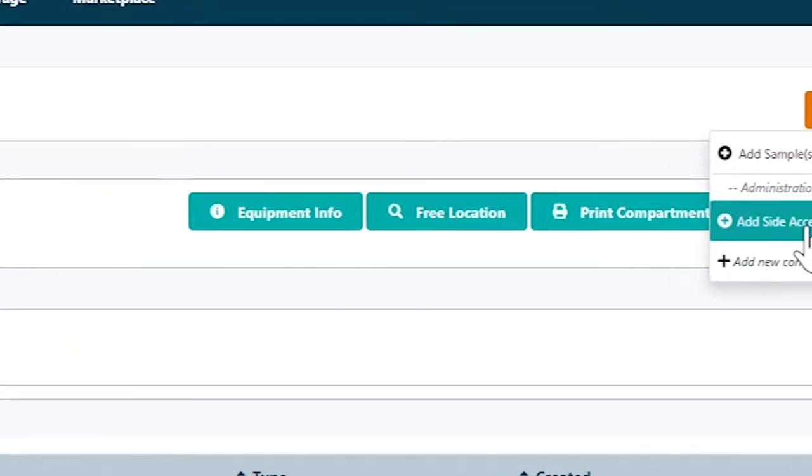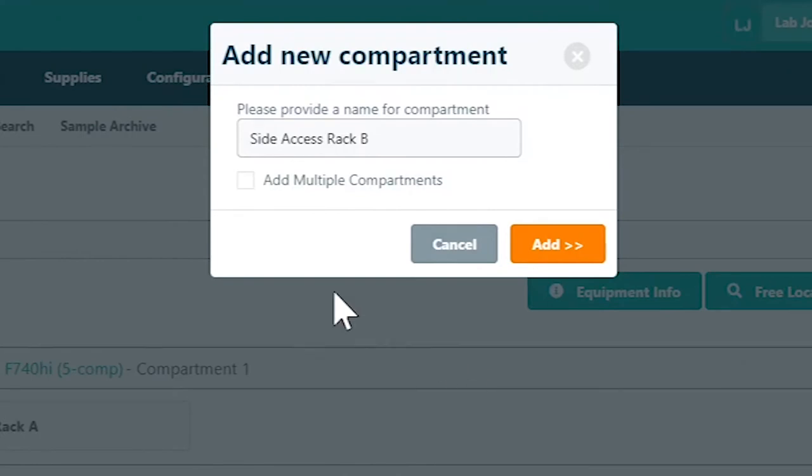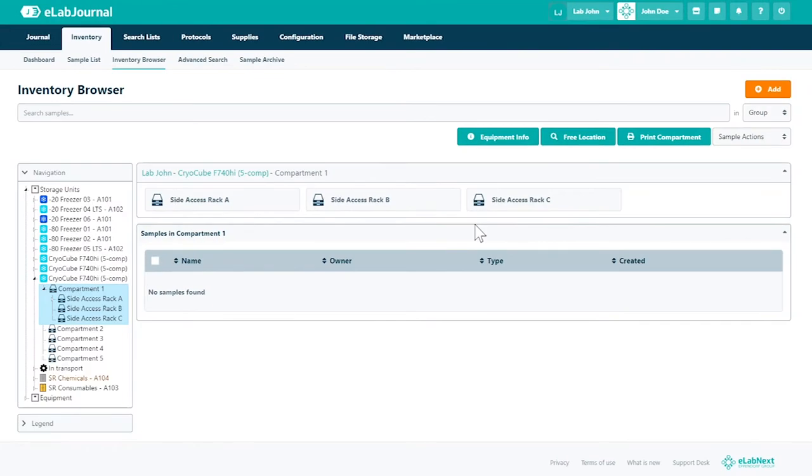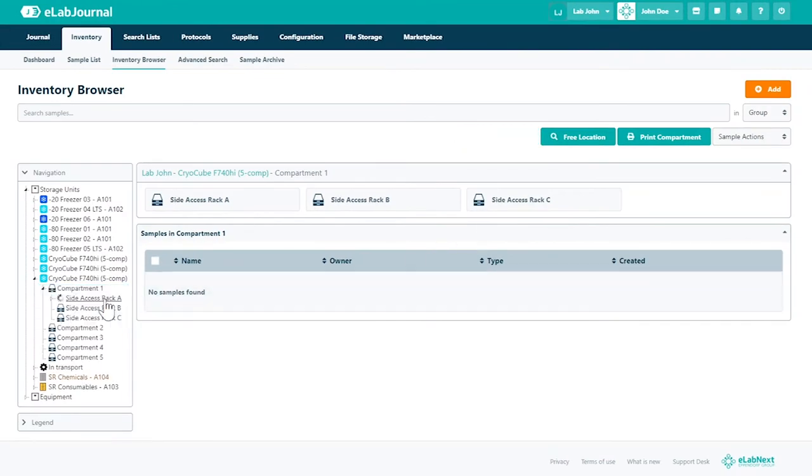You may wish to add more compartments at the same level. To do so follow the previous steps.